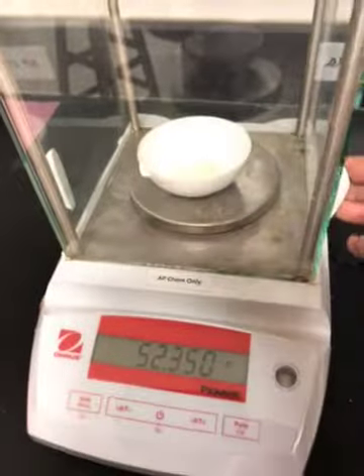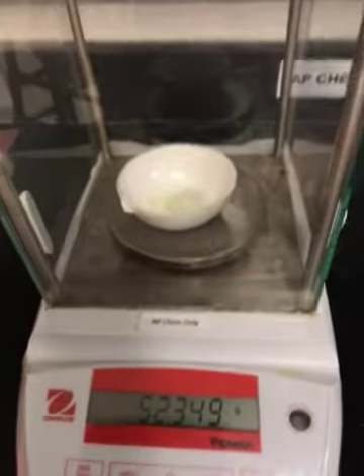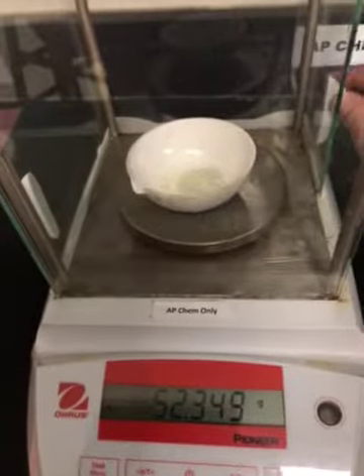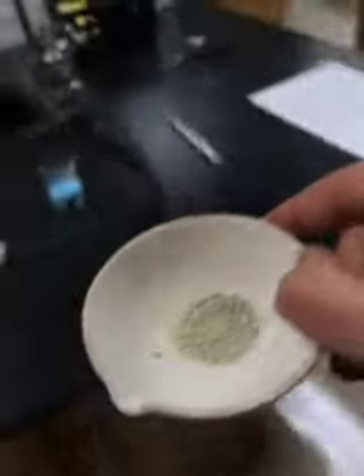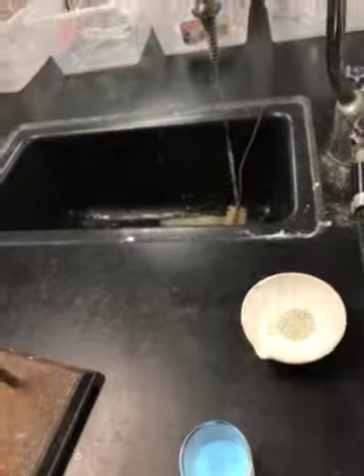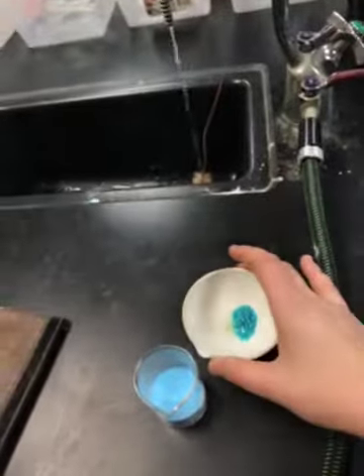I think it's very close to the previous mass, so that's pretty good. So we're going to clean up and do our lab calculations. I do want to show you that when you are cleaning this up, it's pretty cool. If you add a drop of water to it, it's going to get rehydrated, and it's going to turn back to a blue color. Isn't that cool?